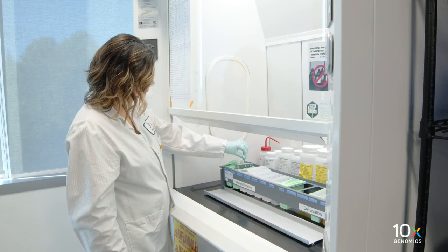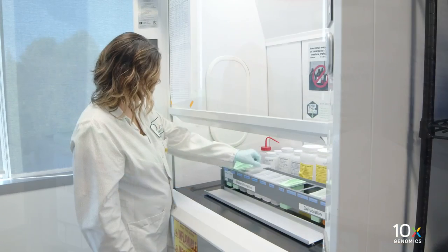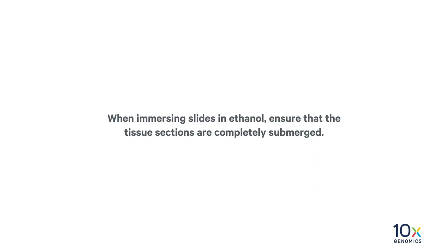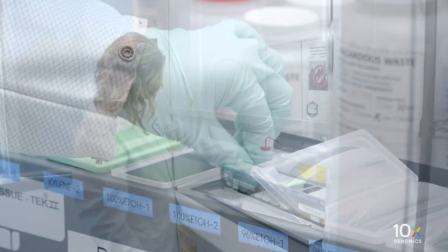Next, we will wash the slides in ethanol. Gently immerse the slides in 100% Ethanol Staining Dish 1 for 3 minutes. When immersing slides in ethanol, ensure that the tissue sections are completely submerged. Gently immerse the slides in 100% Ethanol Staining Dish 2 for 3 minutes.